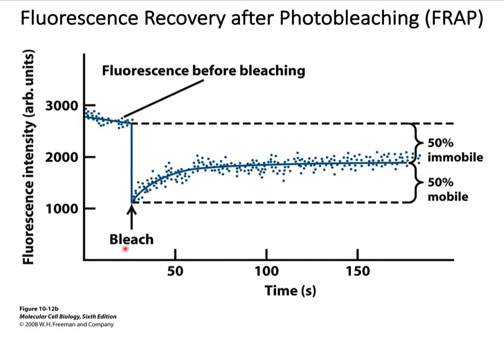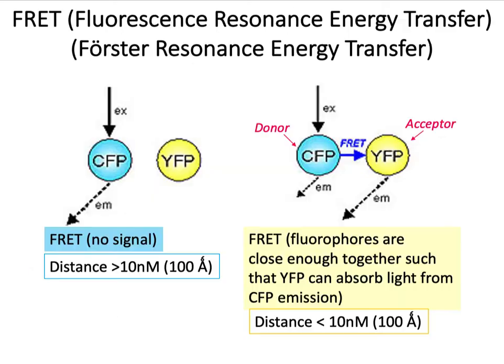In a real experimental setup, even after complete photobleaching, there will be some residual fluorescence and scattering background fluorescence that can't be omitted from the detector. Hence, some fluorescence will be detected all the time. But this background will not take away the merit of this elegant experiment.